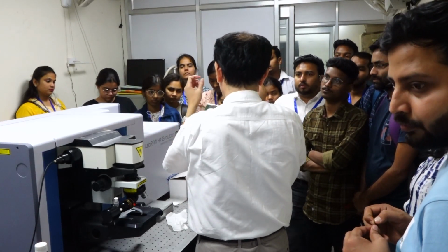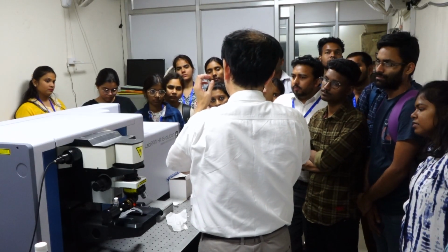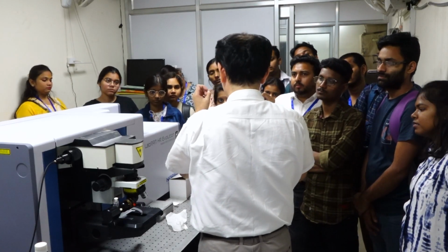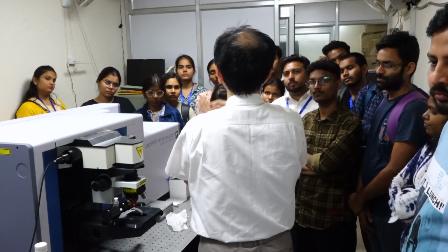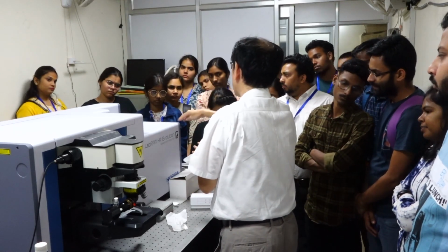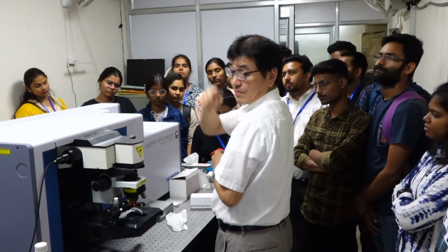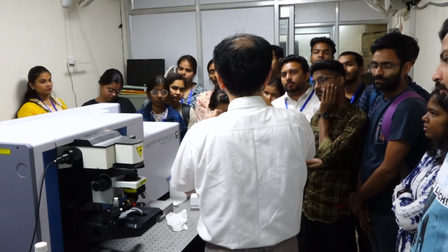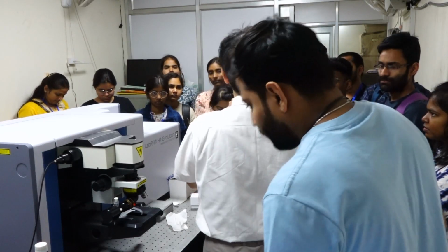So the conversion efficiency is less than 100%. The best value may be 80 or 85%. So not 100%, but anyway, it's high enough to convert photon information to electron information. Then the accumulated charge is counted and transferred to the PC, and it appears as an intensity at each wavelength. This is the spectrum. Okay. Is there any question?